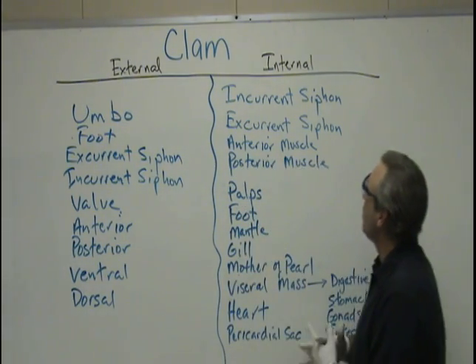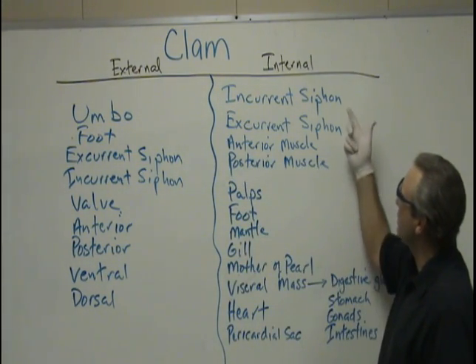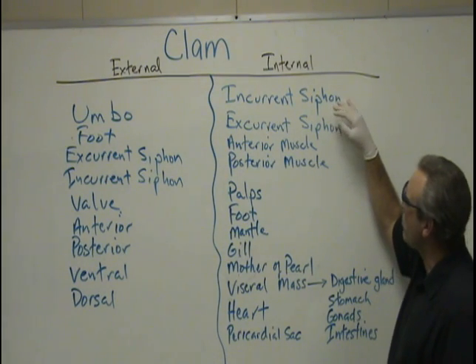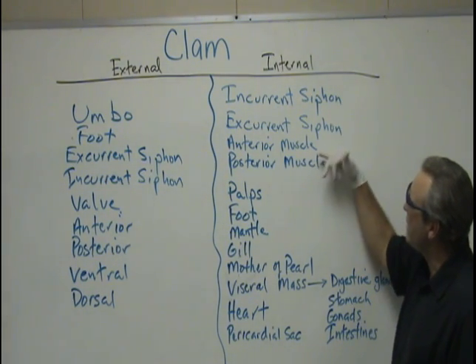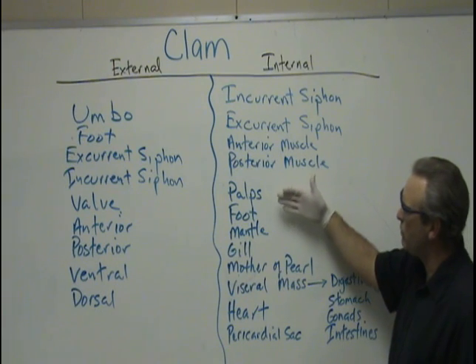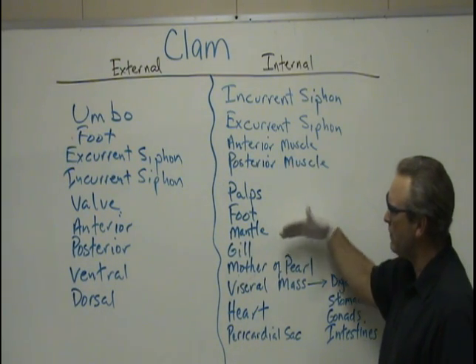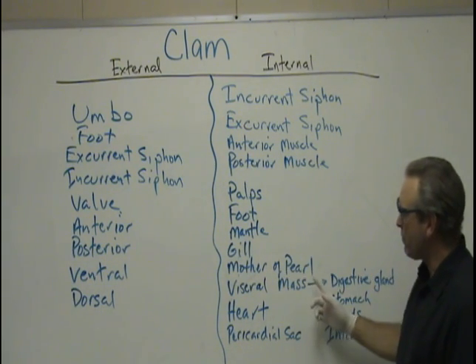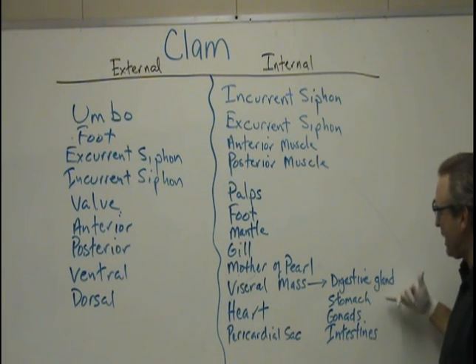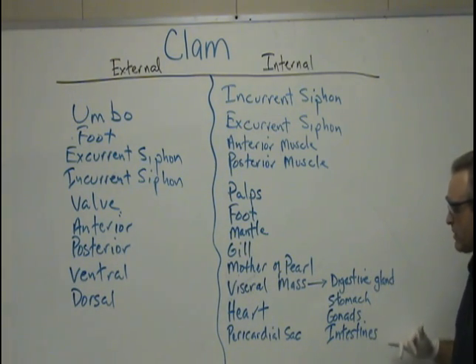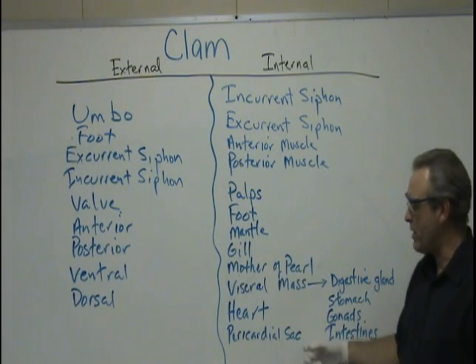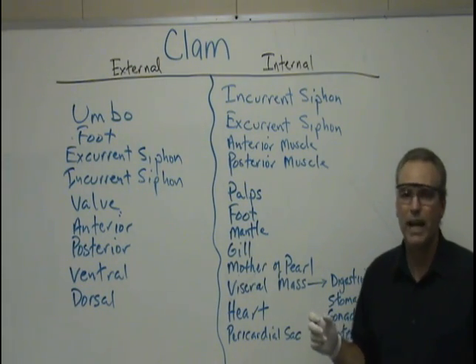Internally, we're going to look at the incurrent and excurrent siphon — these are kind of hard to see from the interior portion — the anterior and the posterior muscles, palps, foot, mantle, gill, mother of pearl, visceral mass, which will have the digestive gland, stomach, gonads, intestines, and the heart and the pericardial sac.